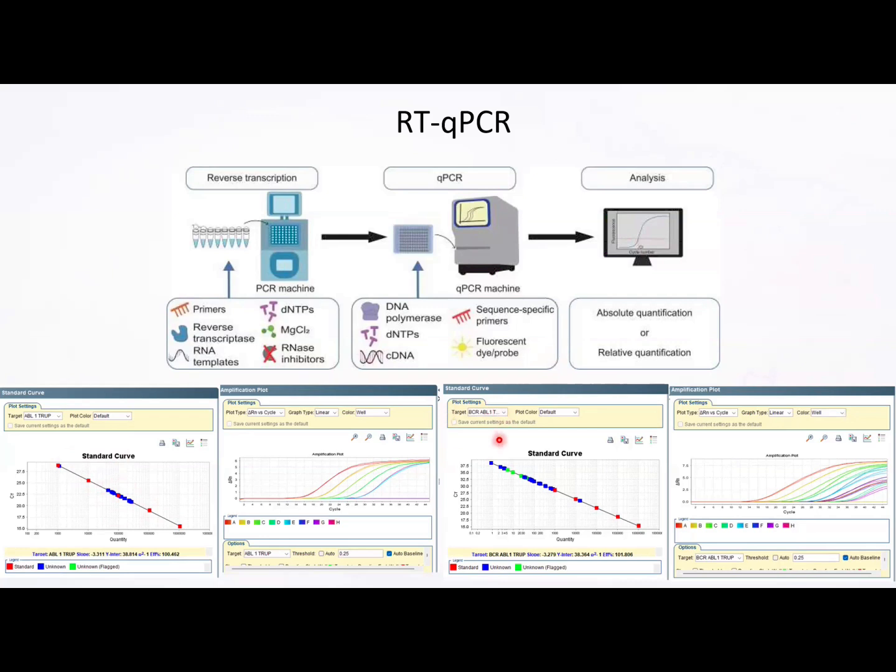In this you can see the BCR-ABL. Again, red ones are the standards, and the standards run from very low copies of say one copy to 1 million copies, and each of the blue and green spots are samples. It is showing that most of the clustering is happening over here. So all the values of each and every sample should be plotted on this particular line for it to be a good analysis or good experimental setup.